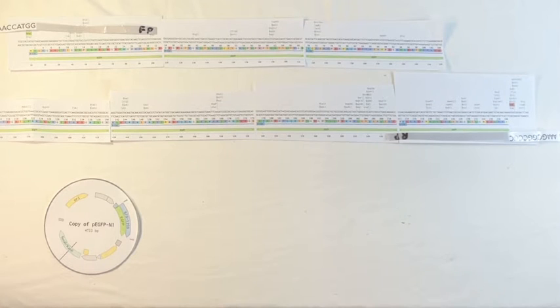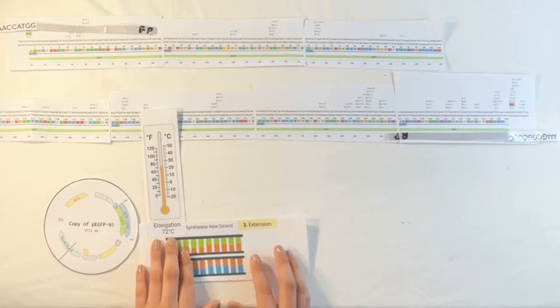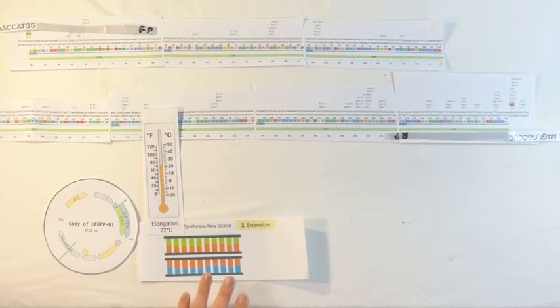In order to do that, we're going to increase the temperature to about 72 degrees Celsius. This step is known as elongation.